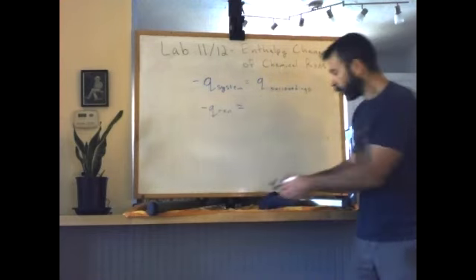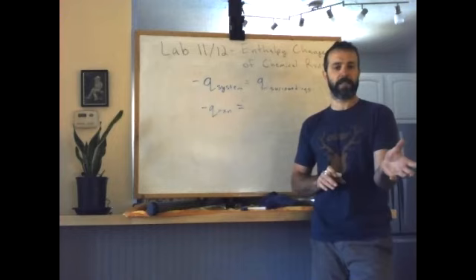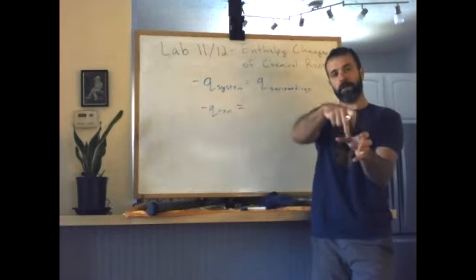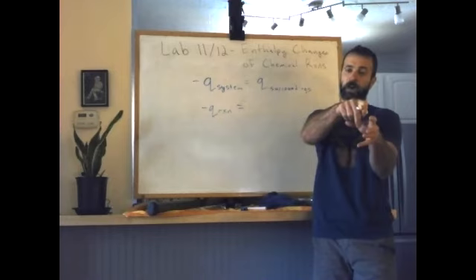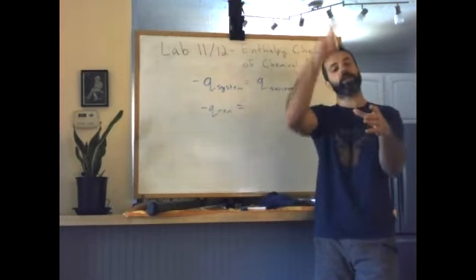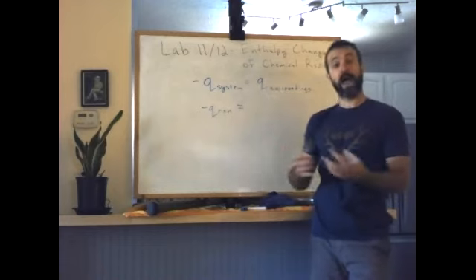So when you watch the video, let's talk about part 2, KCl. You have some styrofoam cups with a thermometer, and you have some water in there. You dissolve KCl and you make a solution. And you look at the change in temperature of that solution. So we're not studying the actual reaction, we're studying the surroundings.